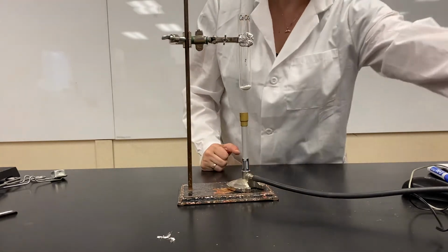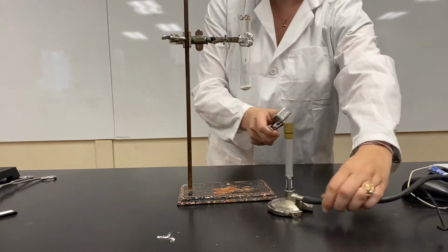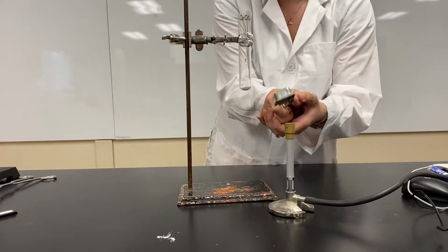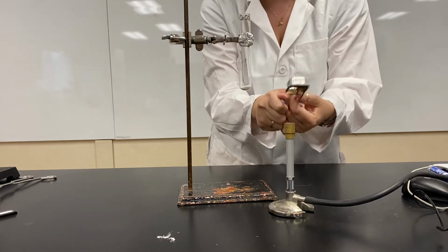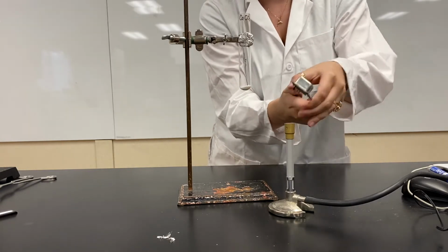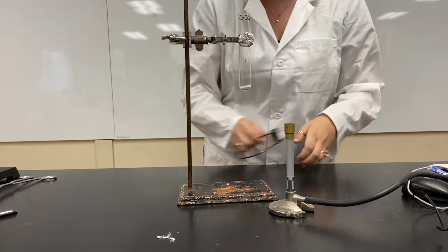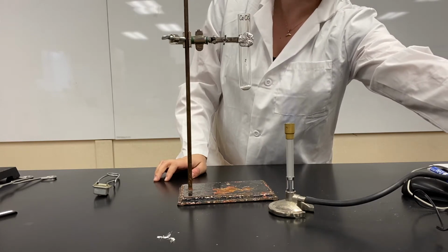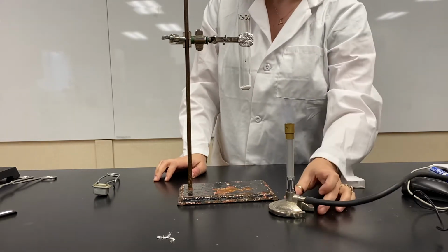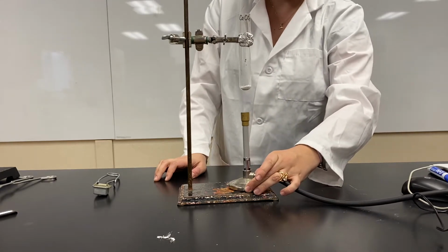So we're going to turn back on our Bunsen burner. Maybe. Striker's stuck. This is not good. There we go. And we turn it down. I'm gonna grab a different striker. And don't move your fire, kids. Okay?